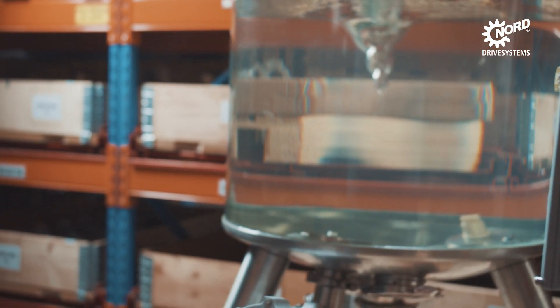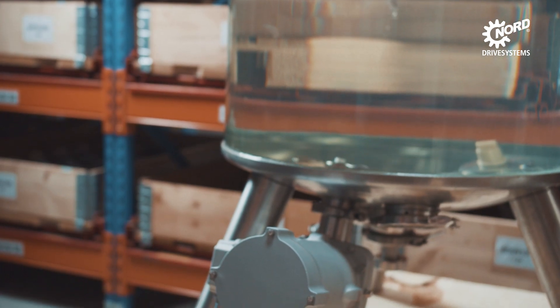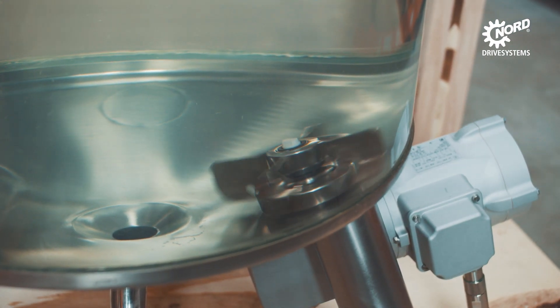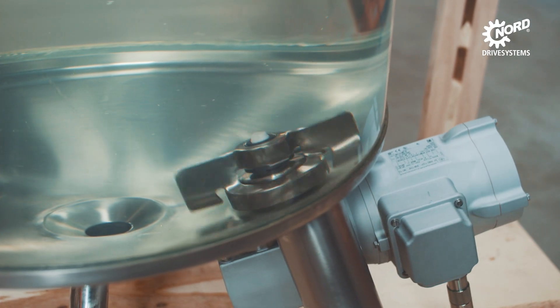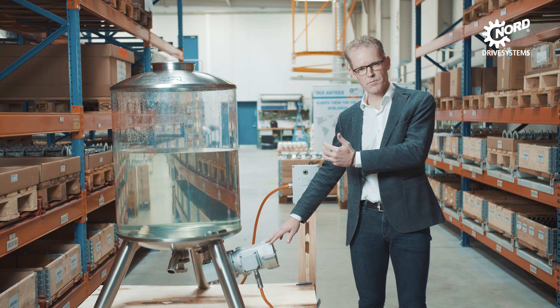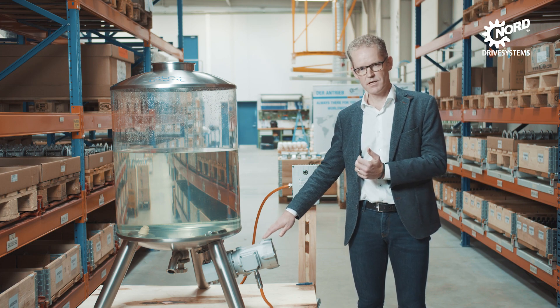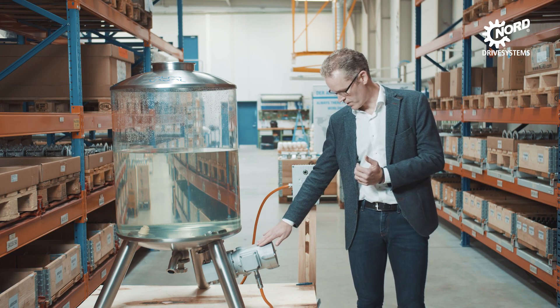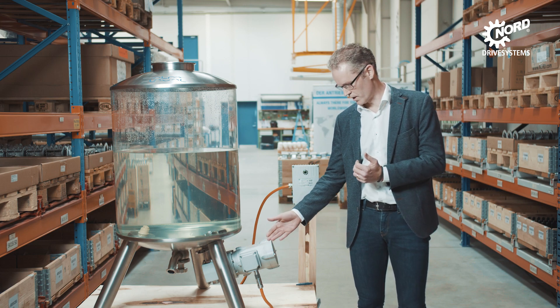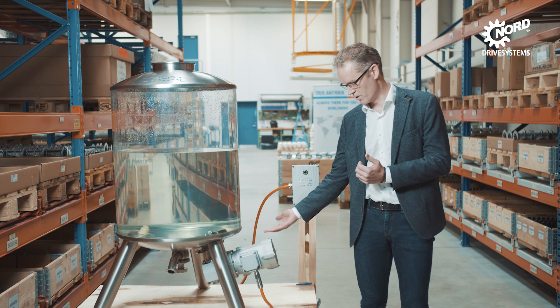In this case, we have a cleanroom motor from Nord. Alfa Laval is a global company, so we have chosen this motor from Nord because Nord is also a global supplier. With this motor, we meet the requirements from our customers in terms of hygienic design, because we have no fans like seen on a traditional motor, where you can have residues resting.